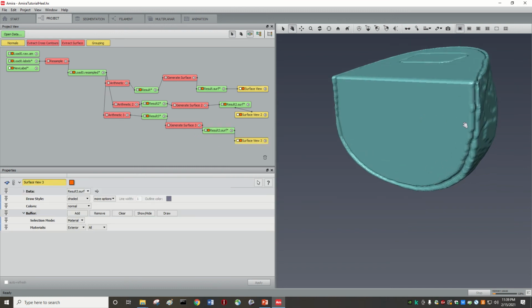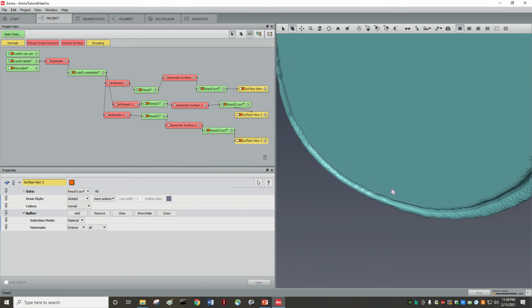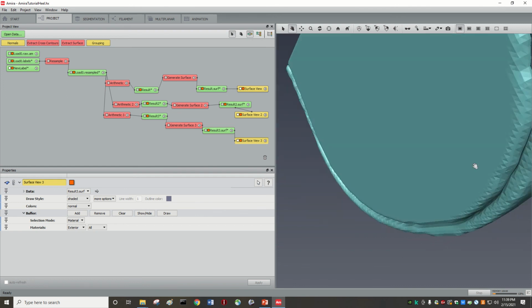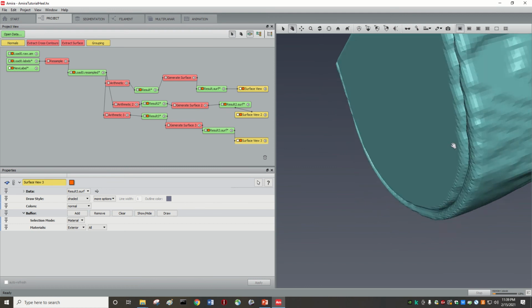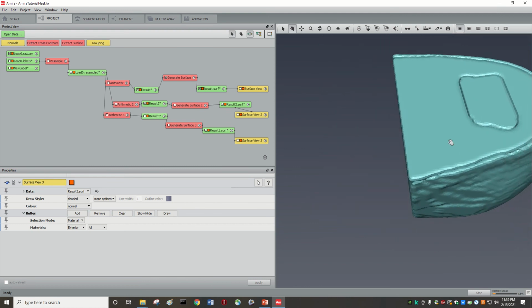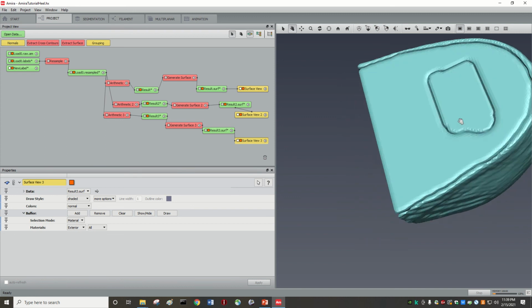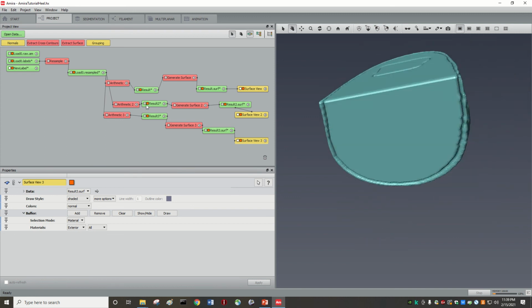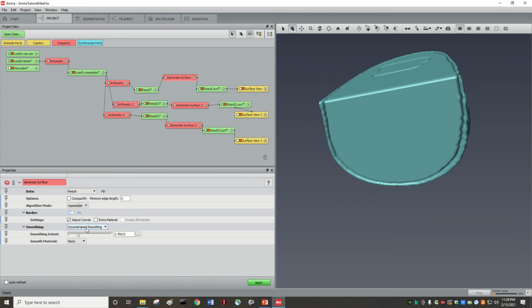So you will see that over here, these two surfaces actually do not match each other. So there is a hole in here, and they are totally defined on different points. But what we don't want, in general, is this. We want surfaces that are lying on the same points. So what we need to do is what is called constrained smoothing.